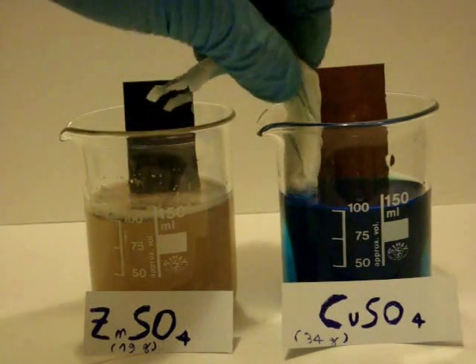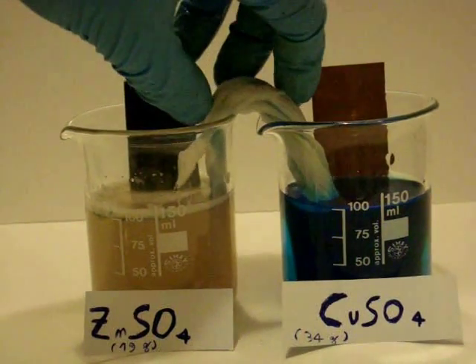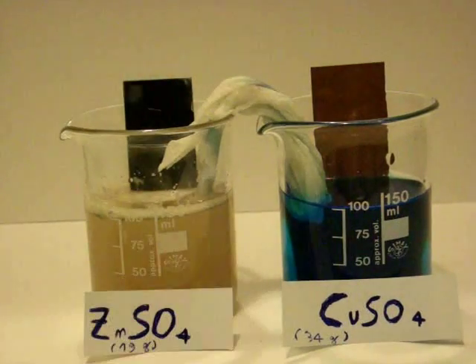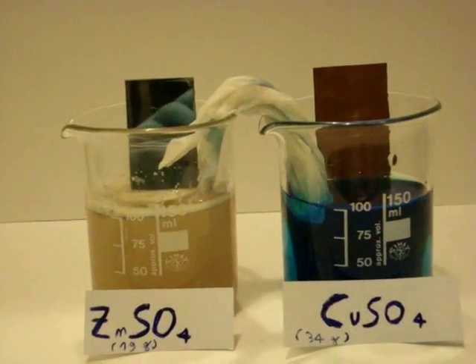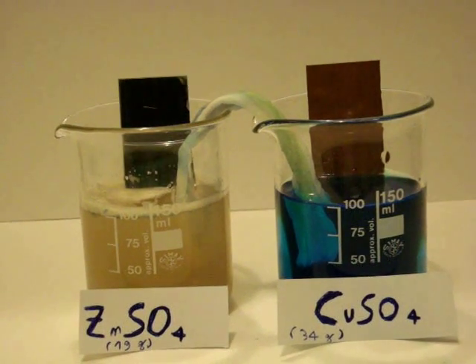Now on the left immerse a zinc foil and on the right a copper one. Connect the two beakers with a salt bridge made of paper soaked in a solution of water and table salt. The ions will pass from one solution to another; the solutions will not mix at all.